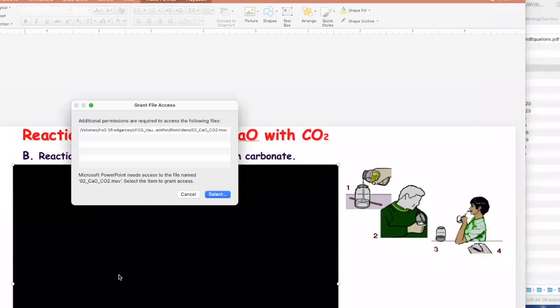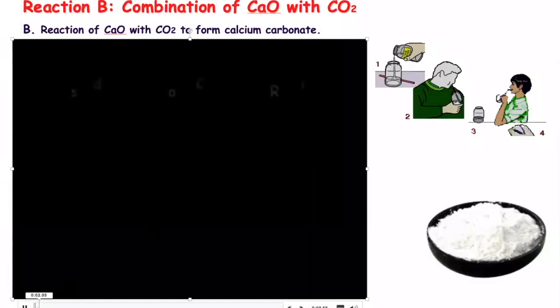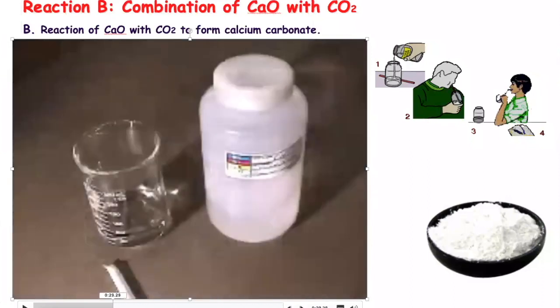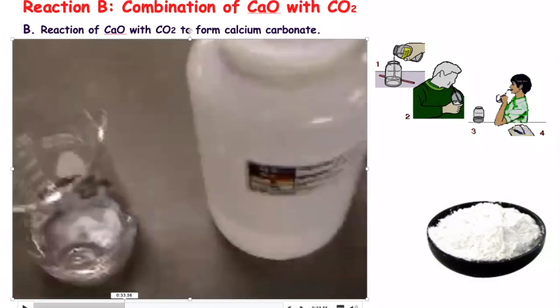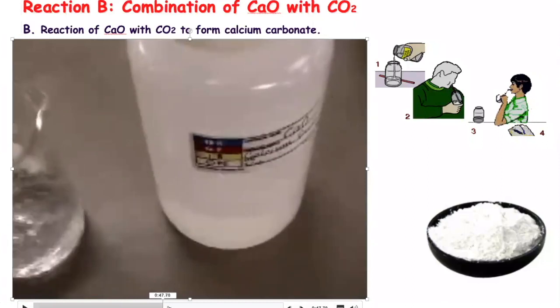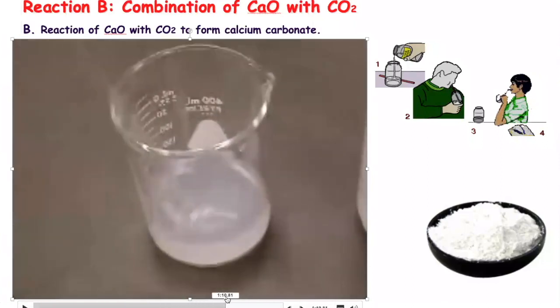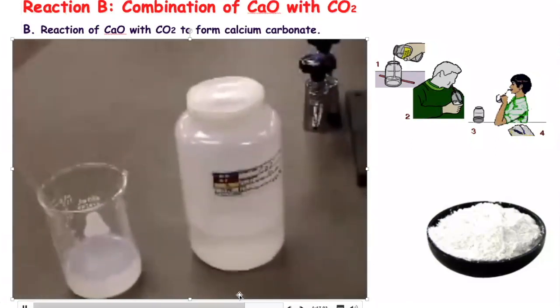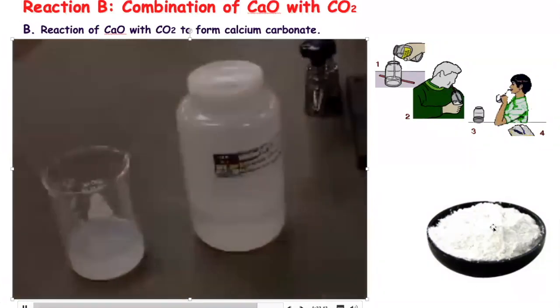Let's watch this movie so you guys can see that. And again, I'm just going to scrub through. Here's lime water, looks like plain water. And here it looks like it's just water, and then I'm blowing off to the side. And I didn't do a very good job centering it, but I am blowing. And here you can see what goes on. That's your reaction. That material that's cloudy, it'll look like this if you have enough of it.